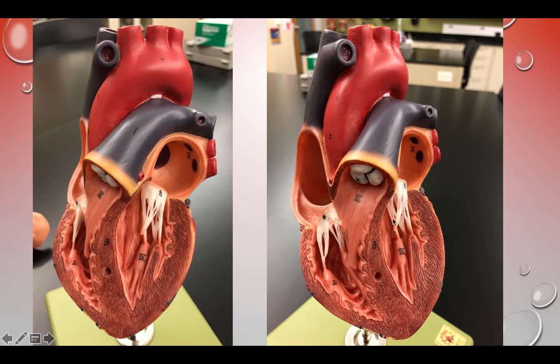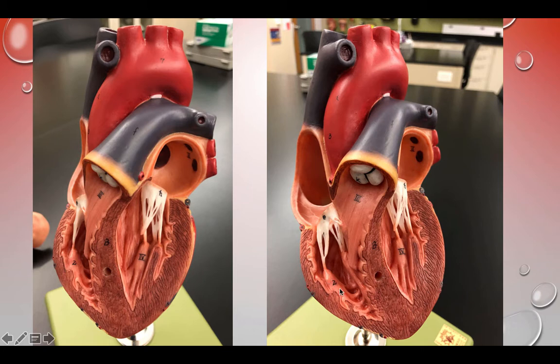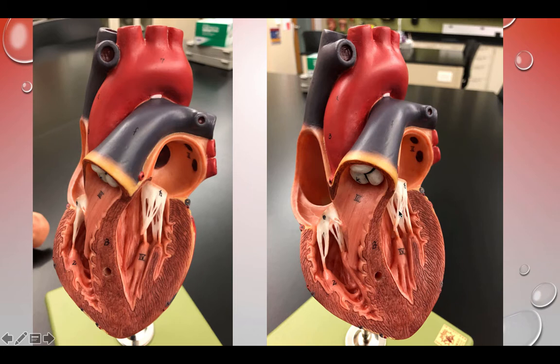The valves are connected to special muscles that contract to pull the valve closed. These muscles are called papillary muscles — here is a papillary muscle here, and here is another one. The string-like structures that connect the cusps of the valve to the papillary muscles are called the chordae tendineae. Here are the chordae tendineae for the bicuspid valve, and here for the tricuspid valve.